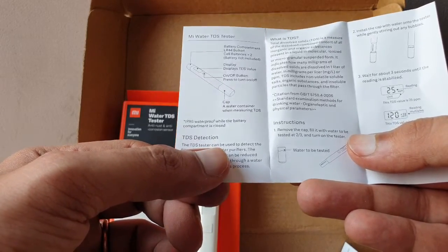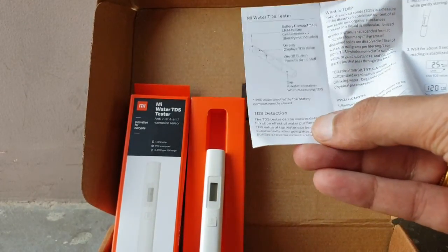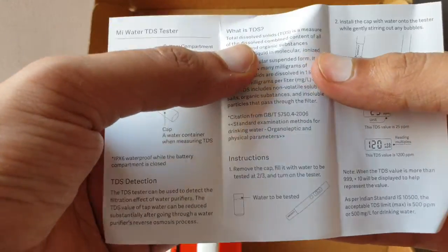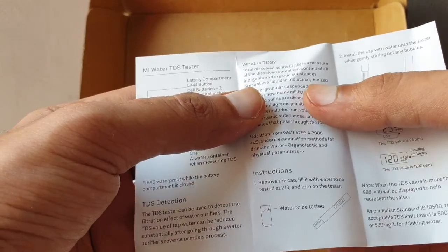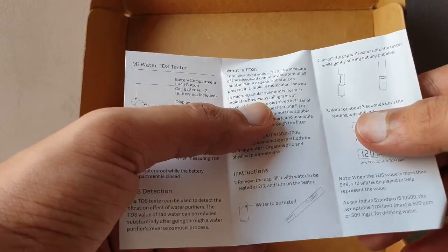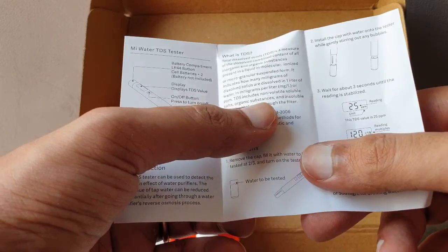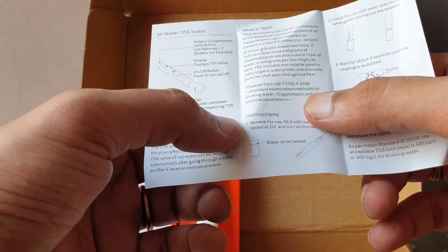The TDS tester can be used to detect the filtration effect of water purifiers. The TDS value of tap water can be reduced substantially after going through a water purifier's reverse osmosis process. TDS — Total Dissolved Solids — is a measure of the dissolved combined content of all inorganic and organic substances present in a liquid in molecular, ionized, or micro-granular suspended form. It indicates how many milligrams of dissolved solids are in one liter of water, expressed as milligrams per liter or ppm.